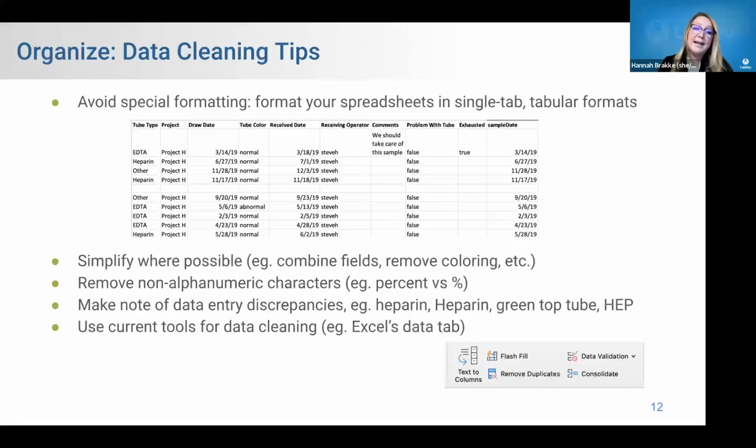And then lastly, I know we've talked a lot about spreadsheets so far, but there are some really, really helpful tools for data cleaning. Particularly, I'll say Excel's data tab is almost my number one favorite thing to use when I'm trying to clean data in a non-programmatic way. So exploring what some of that functionality looks like can really help you get the data in a format that your vendor is looking for.